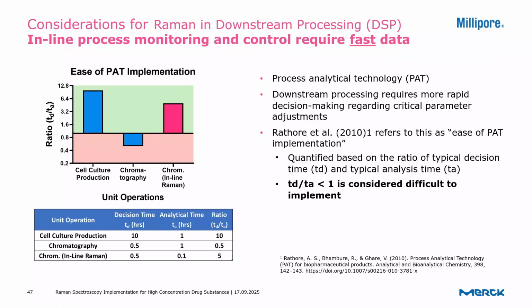When looking at bioreactor cell culture processes, whether they're by fed batch or perfusion, the extended run times, which are normally on the order of days to weeks, allow for generous time gaps between sampling and analysis. In these cases where the measurement frequency doesn't need to be rapid, typical sample removal protocols for at-line or offline analysis a few times a day are effective.